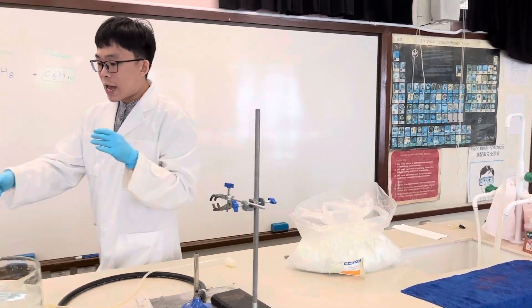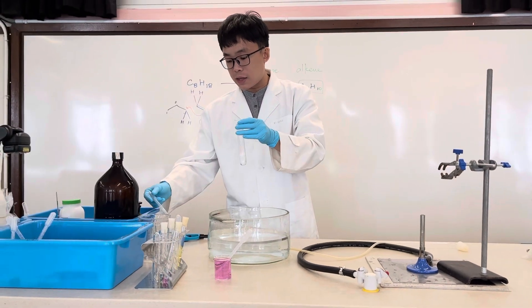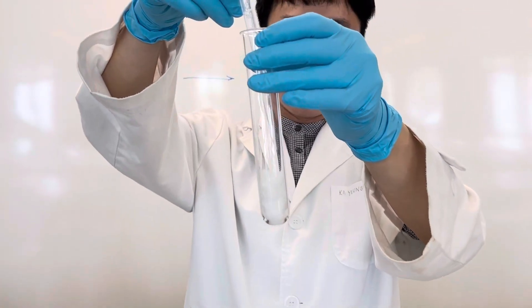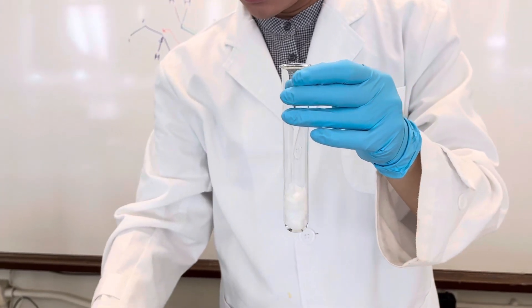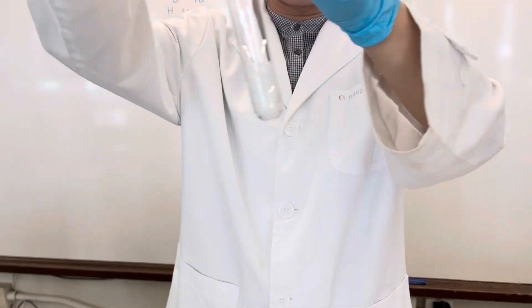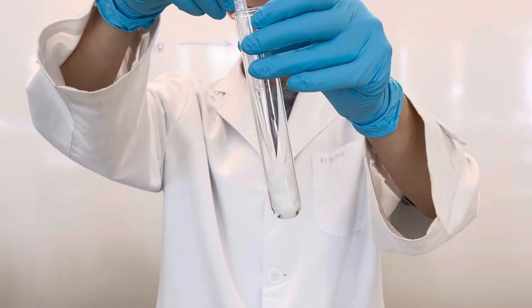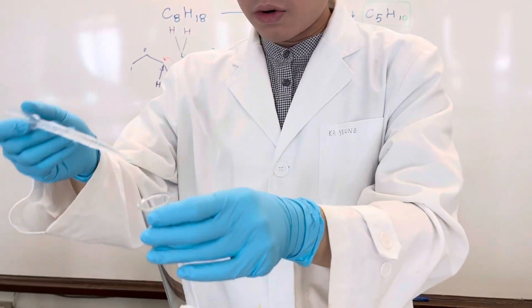We have the medicinal paraffin here, and we are going to add it onto the mineral wool to have it fully soaked in. Here is the medicinal paraffin — add it until the mineral wool is fully soaked.